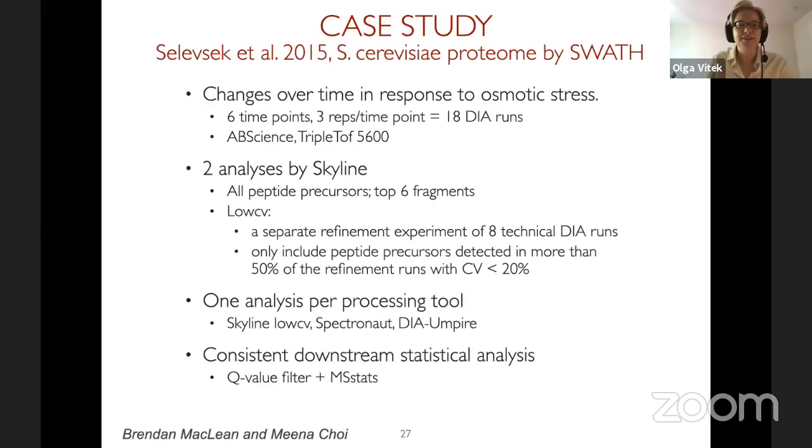So this is a second data set, which Brandon used in the second day of his presentation and Meena will also use in her demo. This was a data set from Selasek et al. It is one of the earlier DIA SWATH data sets. It's a time course experiment with six time points, and it was yeast samples in response to osmotic stress.